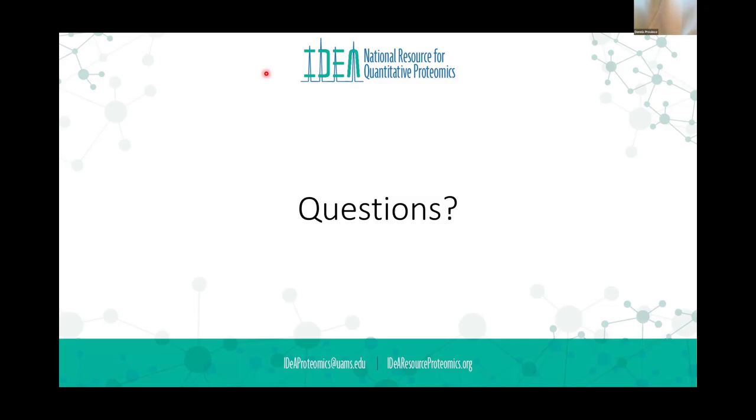With the last talk, the third talk, I was thinking about the difficulties in abundance and all those details. If you're interested in a specific group, like a pathway of proteins that are affected at phosphosites, will that be an advantage? So let's say I set an example and say, I'm interested only in this pathway. So the question is, if you're interested in a specific pathway or specific proteins, and you tell us when you submit the samples, does that help us?